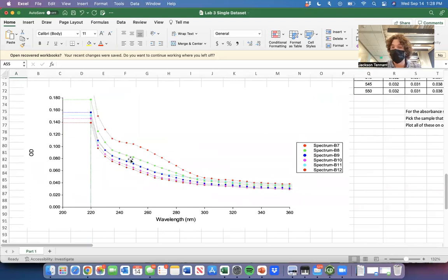And then lastly, the DNA sample. DNA absorbs most strongly at 260 nanometers. And indeed, in biochemistry, we can take advantage of this when purifying proteins, which is something I do all the time. We can look at how much DNA versus how much protein is in the sample by looking at the ratio of the absorbance value we get at 260 nanometers versus what we get at 280 nanometers. And that's kind of all you need to know about that.